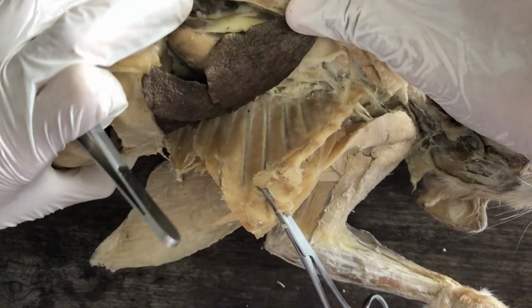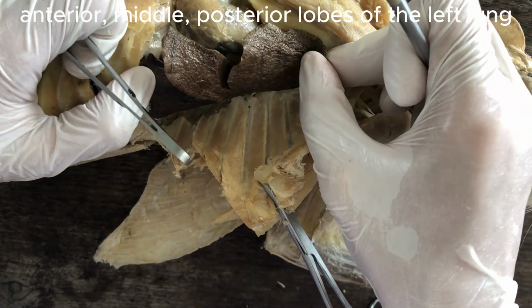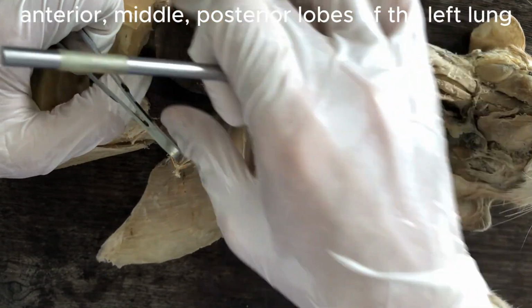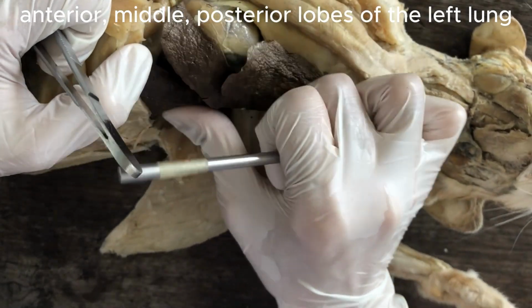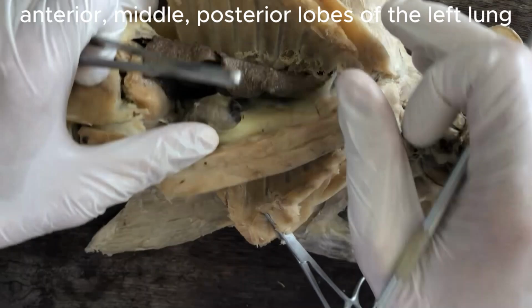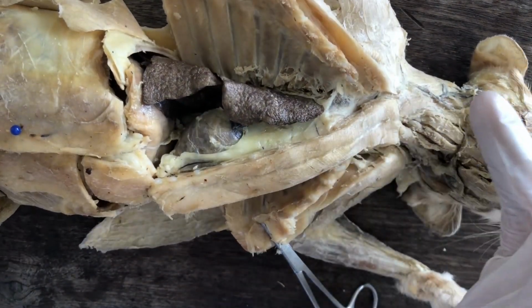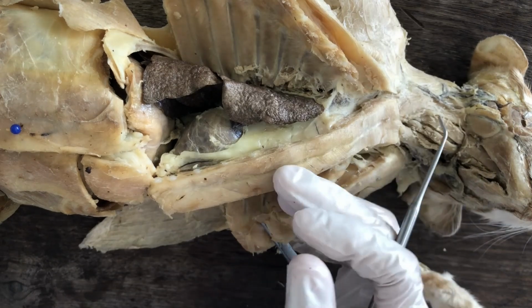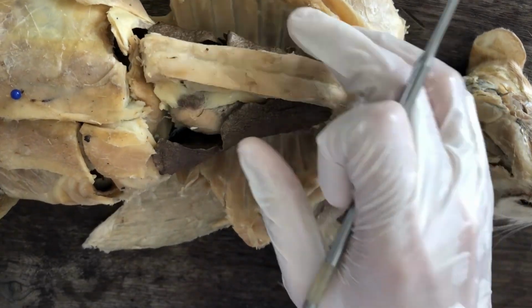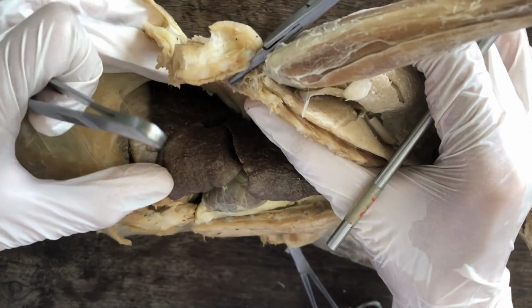Likewise, on the left side, there's going to be an anterior left lobe, middle left lobe, and then posterior left lobe of the lung. But the right lung in general is larger compared to the left lung. So there's an additional lobule.